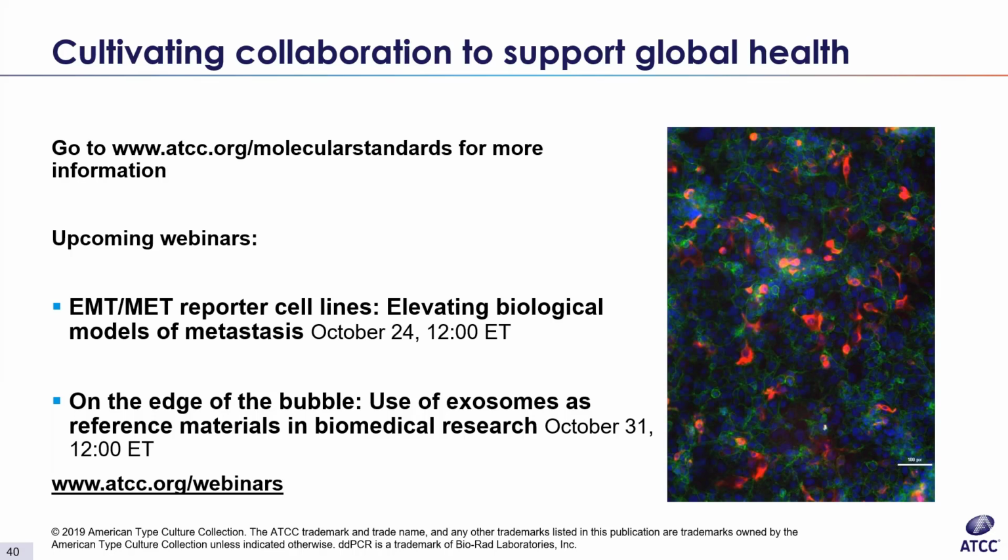Okay, and here's the next question. It's around reference genes. What reference genes do you use for bacteria, viruses, and fungi with your qPCR? So for the qPCR for synthetics, we just used a published assay for one of the genes that we've chosen for the construct. For general quantitation, it varies organism to organism. So we try to choose, or we do choose, a single copy gene for protozoans and for bacteria. And then for viruses, we try to choose something that's going to be conserved as the virus passages.